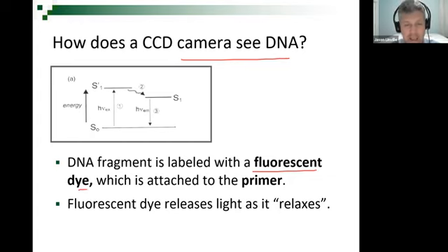You can amplify DNA without a fluorescent dye, by putting the DNA in a tube with primers, polymerase, and dNTPs. But in this specific type of analysis, since we know beforehand that we're going to want to separate and measure our DNA, we label our DNA in the amplification process.